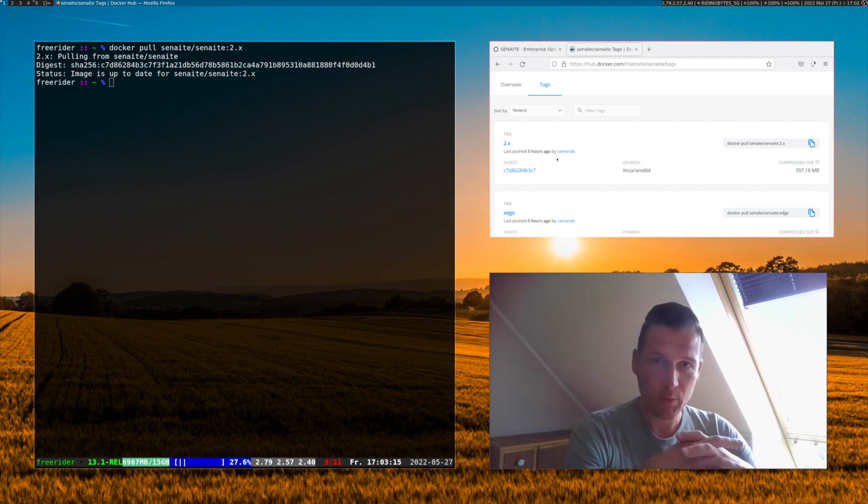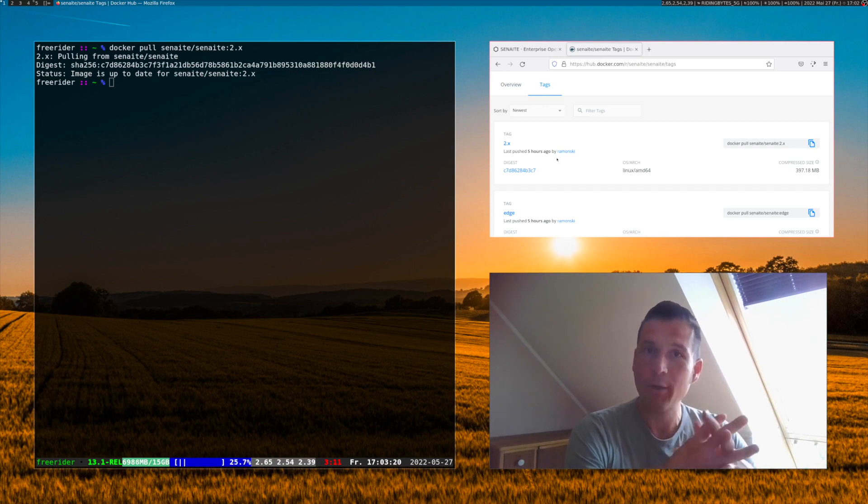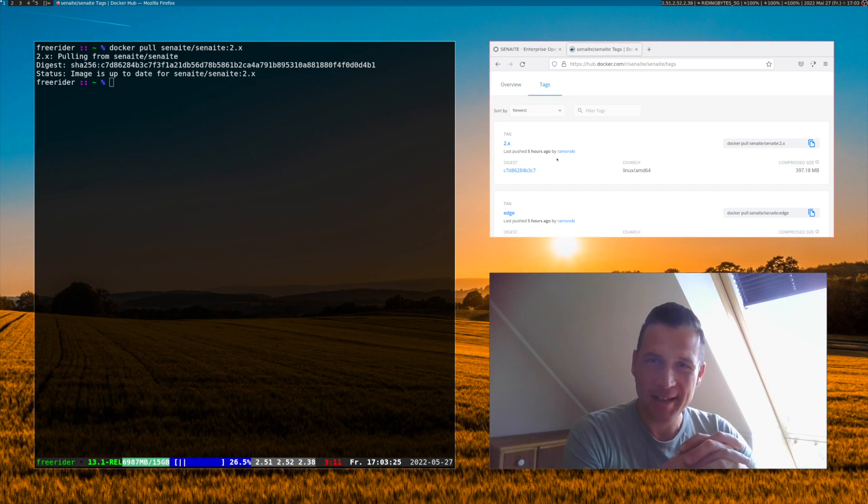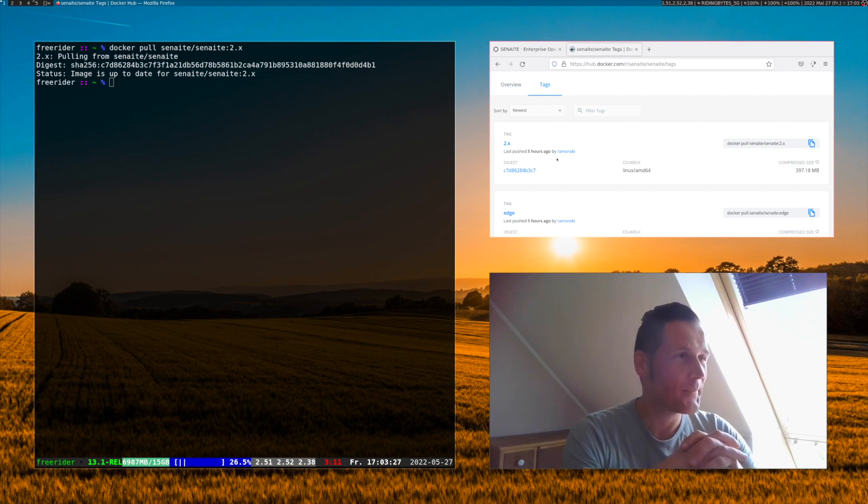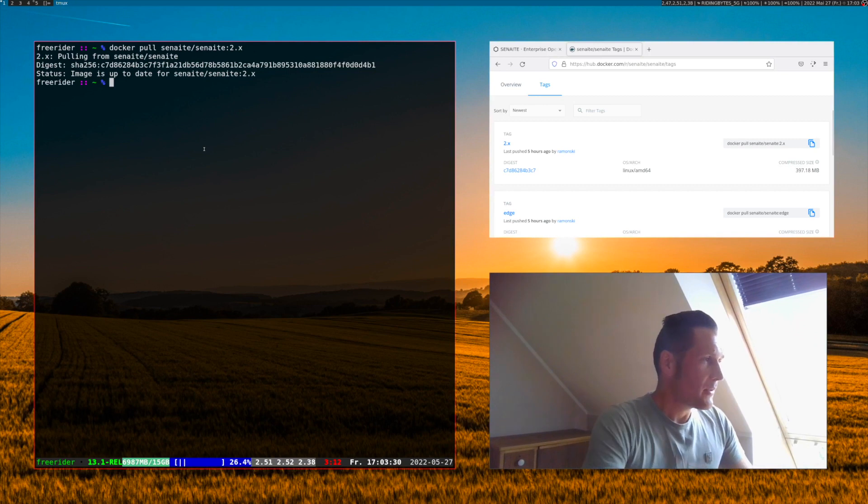This is perfectly suited to test and check out new functionalities in Senn8 but obviously not the right choice to run a production site with that container. All right, we downloaded the version.